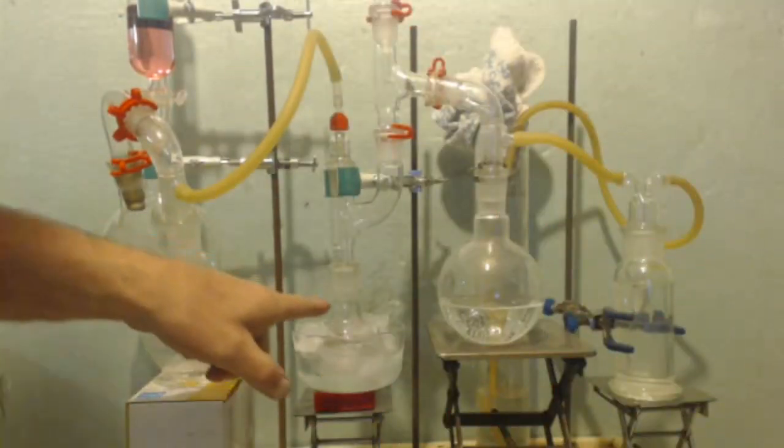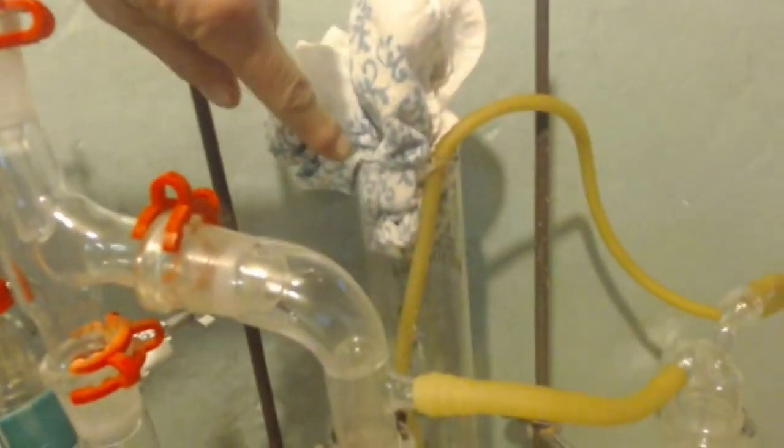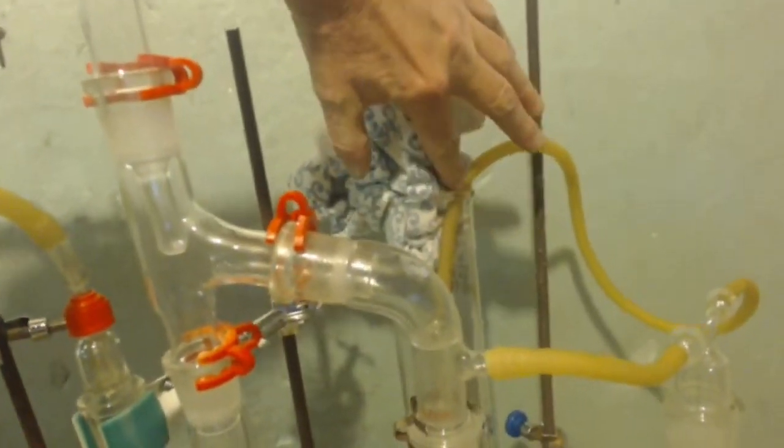Now you can see I got my ice bath here for the HCl, and up here where that graduated cylinder is, see how I jammed a towel in there. I mean, it's like a filter, not a plug. You want to put it in so it's not too tight. And plus it can escape here a little bit too, so it won't build up pressure.